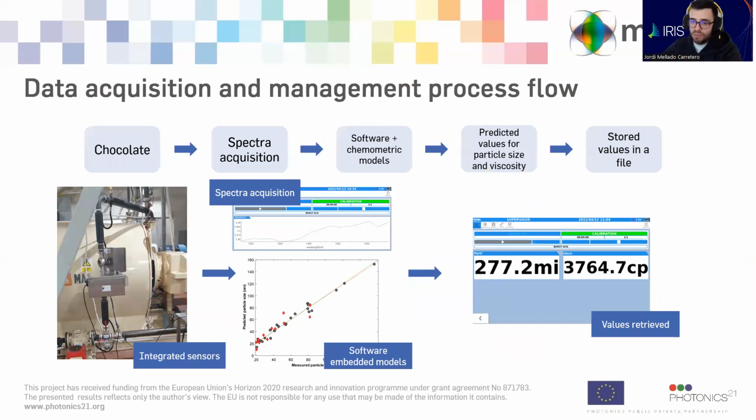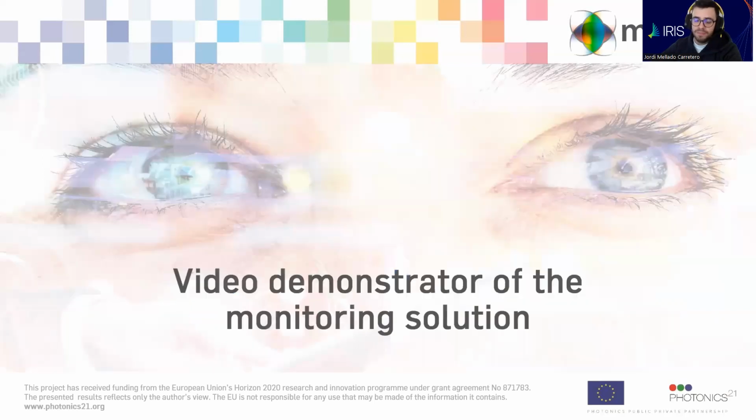The working flow of both integrated prototypes is straightforward. Chocolate spectra are acquired in real time, online, inside of the conching machine via an integrated software, which has chemometric models embedded in it. The same software displays the predicted values for viscosity and particle size, and finally stores them in a file. Let's watch a short video with the demonstration of the monitoring solution integrated in the conching process.